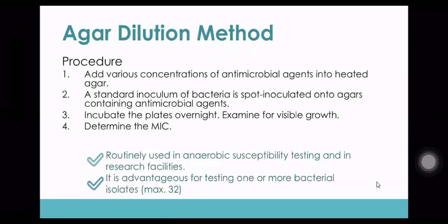Agar dilution method. Number 1, we need to add various concentrations of antimicrobial agents into the heated agar. And then number 2, a standard inoculum of bacteria. Standard inoculum, magambal kita inoculum gani atong pure culture or pwede man nga ginhimo naton halin sa specimen sang isa ka pasyente. And then, compare to siya sa McFarland standard. Amo na siya ang standard inoculum of bacteria.